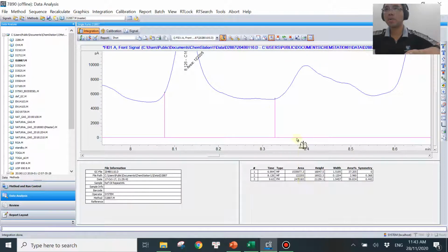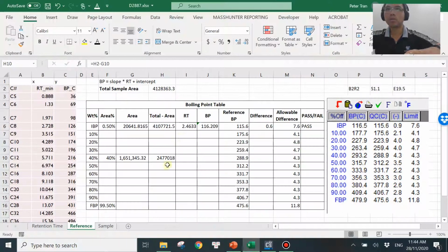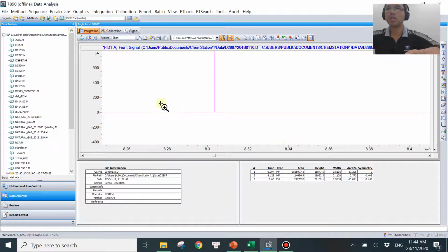That's very close. If you want you can try to get a little bit more, so maybe somewhere here, a little bit lesser over here, a little bit more. Oh, I'm sorry, we have to move to the left side. That's a bit confusing. 2.75, that is very close. 2.77. Okay, a little bit more. There you go, very close, right? Even the last number, I think we don't need to worry about. So this will be the correct retention time that we need to have to take for this 40% level.